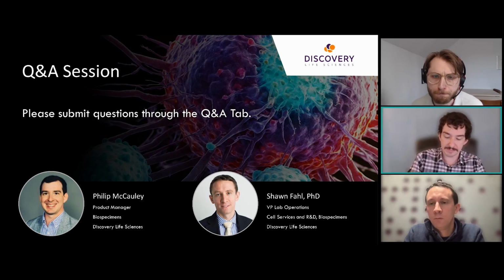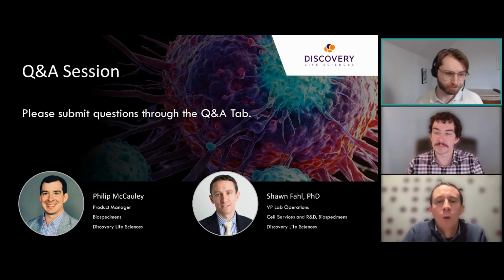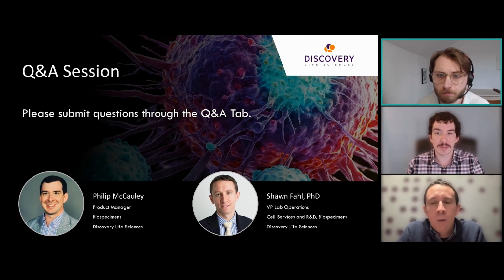This person says, great talks. Do you have functional killing assays with immune cells? Yeah, I can take that one. Currently, we're developing the data there. As Phil and I meet basically weekly to talk about tumoroids, we have quite a lengthy list. That one's pretty high on the list to do.